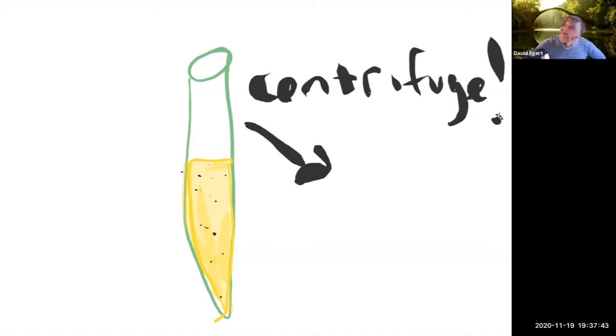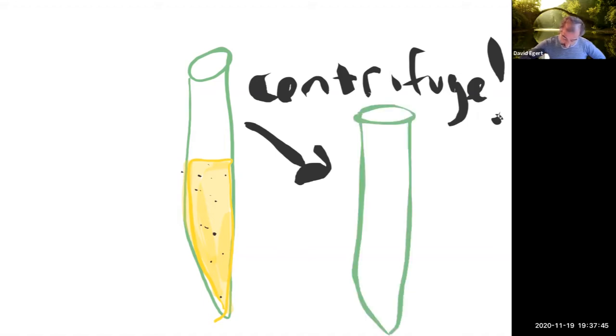And what you're going to end up with is some little pellet of stuff.